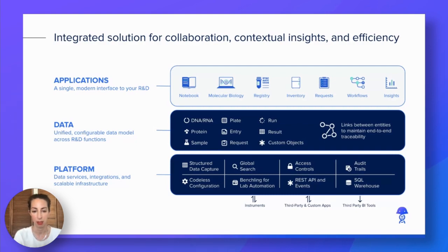So the RNA therapeutics capabilities Andrew is about to share with you are built on this foundation and extend to support the specific needs of modifying oligos. Andrew, could you walk us through those capabilities?